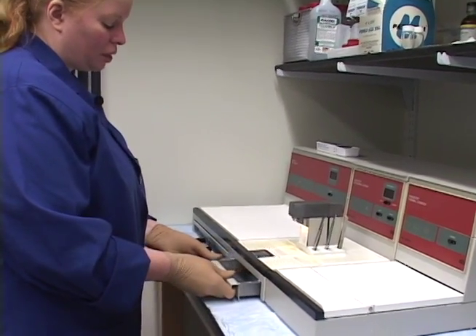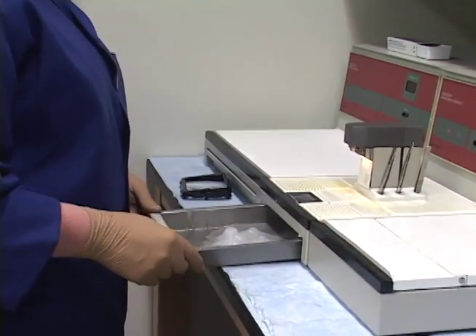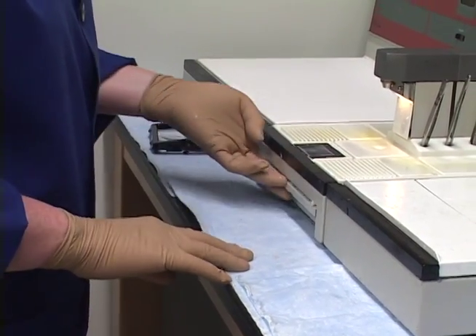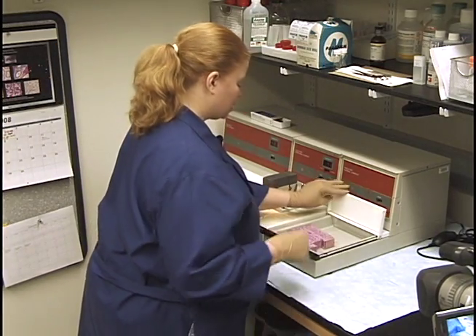There's a drawer here that collects paraffin as it drips down. When we're finished embedding, we'll want to scrape this all out and give everything a good wiping and cleaning. For now, let's get started embedding.